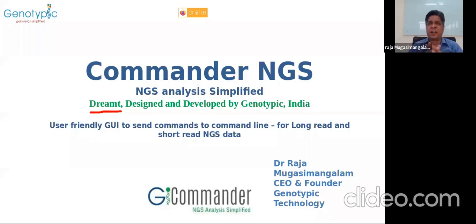NGS was getting into biology and made a big difference for biology. When I worked on the Human Genome Project, it took almost 20 years, actually 10 years, but finally after 20 years, we could show the first human genome. Now with the machines we have, we can do it in 1 day's time, and it can also be analyzed. But strangely, while NGS technologies were moving, biologists were moving away from NGS.